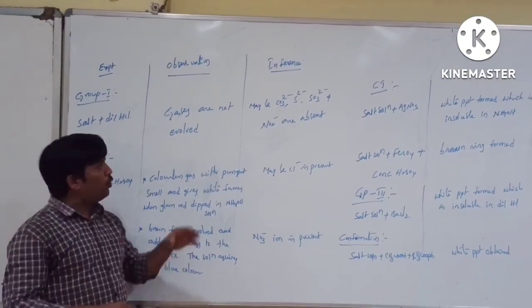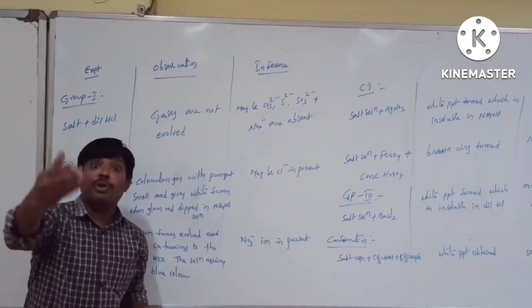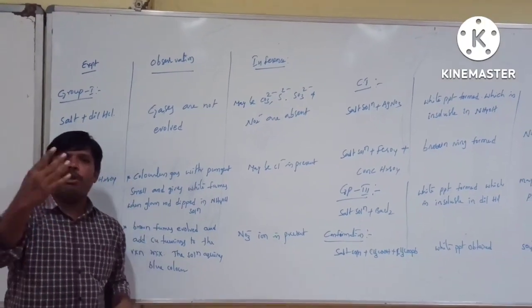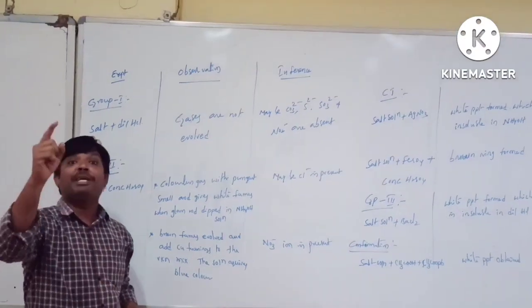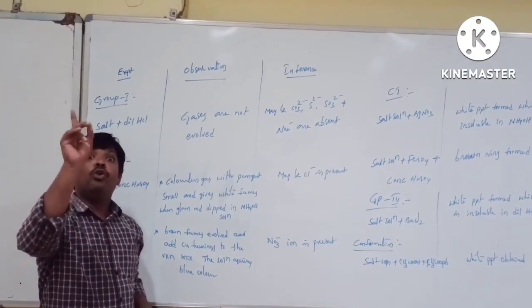మనకి తెలిసినా కానీ group 1 లో లేదని తెలిసినా కానీ, but you have to write. ఓకే, నీకు అర్థమైపోయింది గ్రూప్ 1 లో లేదని. అయినా కానీ before going to group 2, group 1 must be written. ఓకే, లేకపోయినా కానీ నువ్వు రాయాల్సిందే.